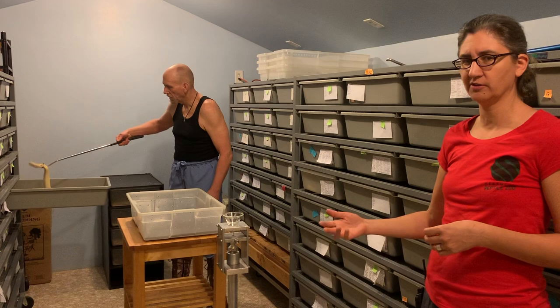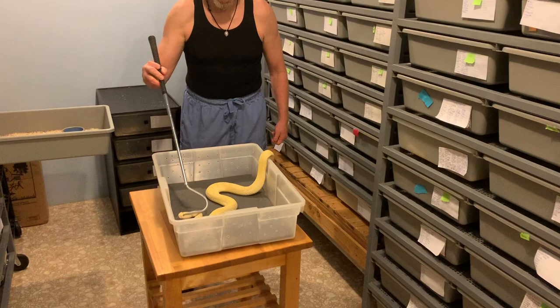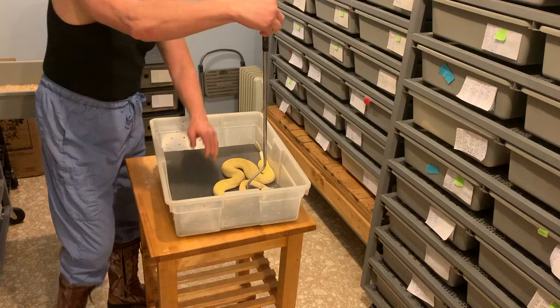We've found that as long as the snakes are healthy to begin with, there's not really very much excess material or cellular debris of any sort in the venom. Sometimes snakes are really unhealthy or have some sort of infection that can end up in the venom, but if we know of anything like that going on with our animals, we don't extract from them.